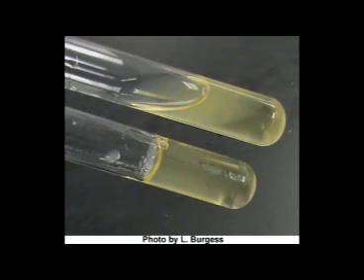Here are the results for a positive and a negative gelatinase test. Notice at the top, this organism is positive. The media has liquefied since gelatinase has broken down the gelatin that was present in the media.